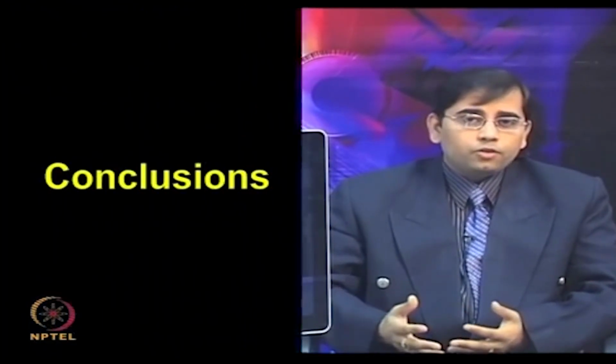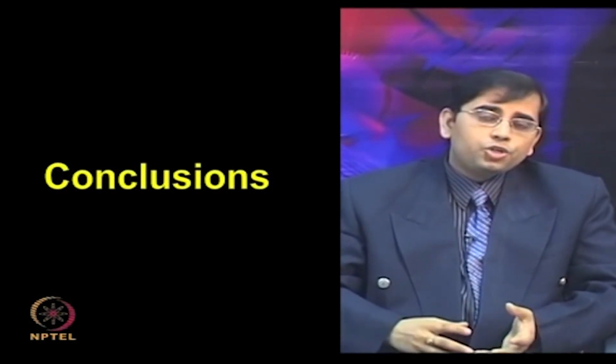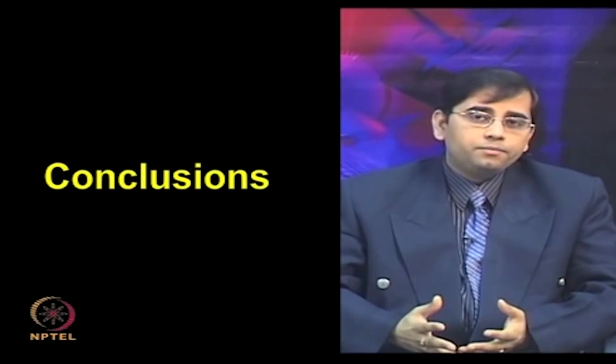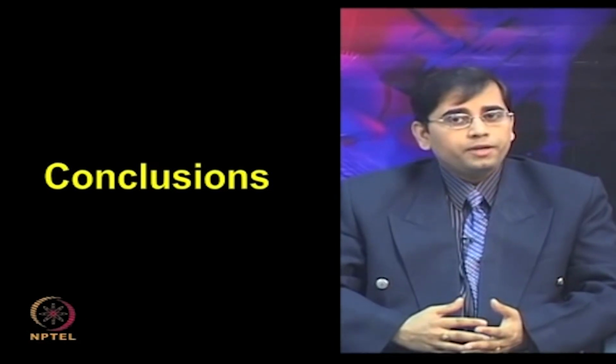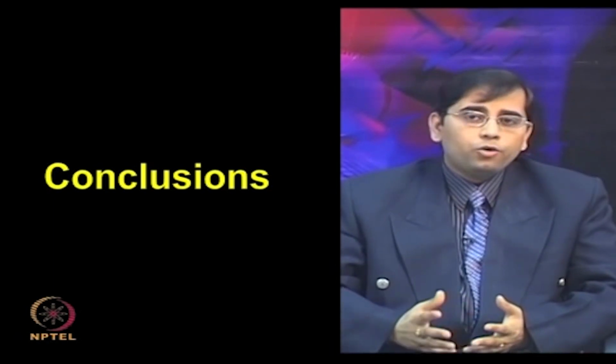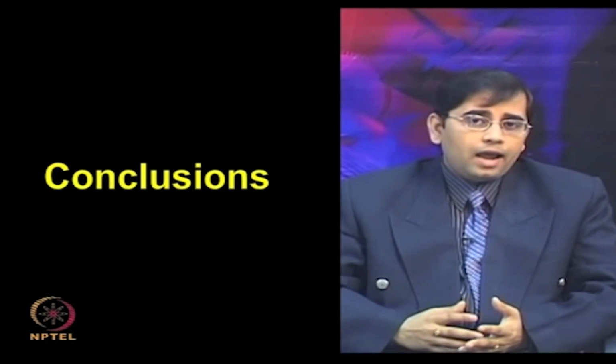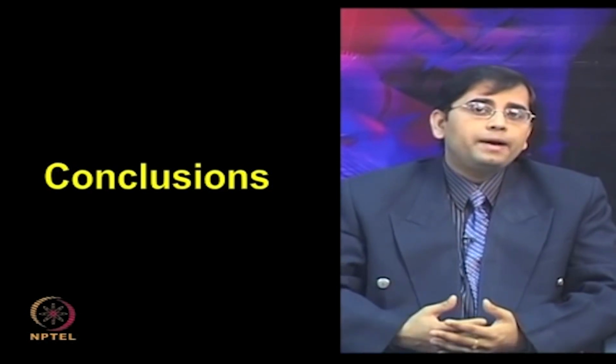The conclusion from this whole discussion is that since the introduction of the Biacore SPR instrument, SPR spectroscopy has become widely used from chemistry and biochemistry to characterize biological surfaces and monitor biomolecular binding events.